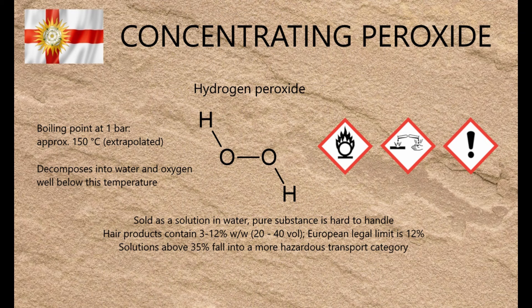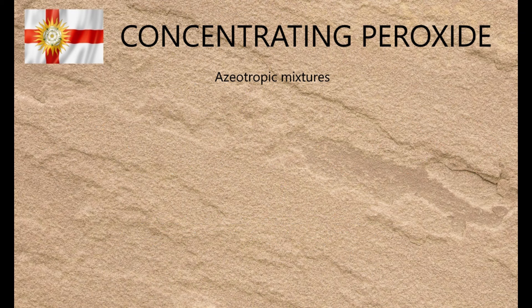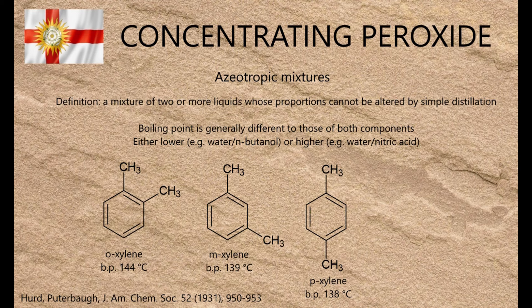There are two ways this can be done: vacuum distillation, and cold distillation with a substance that forms a low-boiling azeotropic mixture with water. In 1931, Hurd and Poonterbohr considered this problem and came to the conclusion — why not do both? They published a paper detailing their findings, and that paper is the basis of the method I'll now demonstrate.